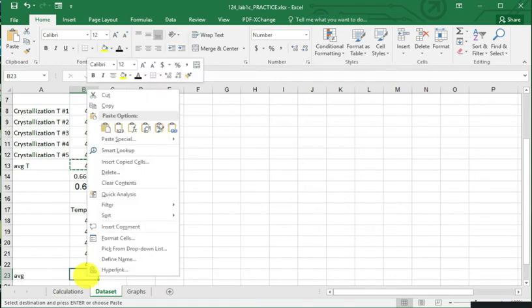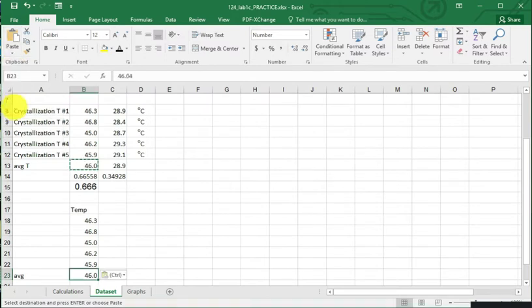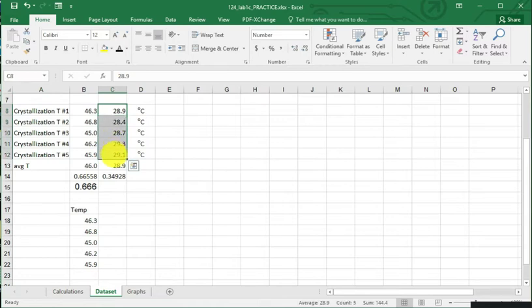No, I really want to do this paste special and just paste the values, because remember this was calculated. It turns out because I have it in the same order it would work, but I'm going to leave that alone. I could also do them at the end. You know what? I'm going to switch. I changed my mind. Now I'm going to put the other, these are all the individual ones. Remember, I want the individual ones.